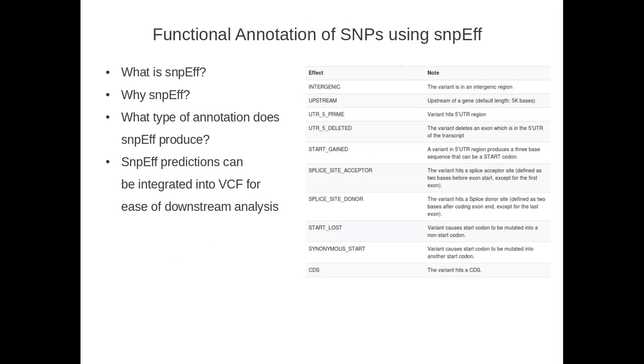So this is a totally different topic now. We're almost to the end of the lecture. This is a long one, and I apologize for that. Hopefully you've put this on pause and had something to drink or whatever. But what I'd like to do, in the last couple of minutes here, is introduce you to the functional annotation step where we deal with SNPs. I'd like to tell you about the VCF format briefly, and I'd like to introduce you to the GATK.